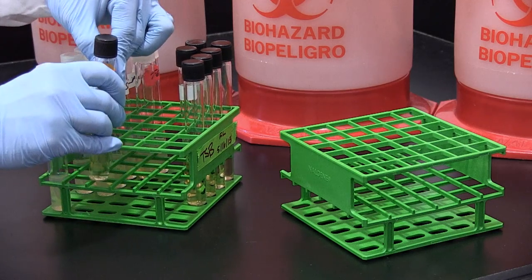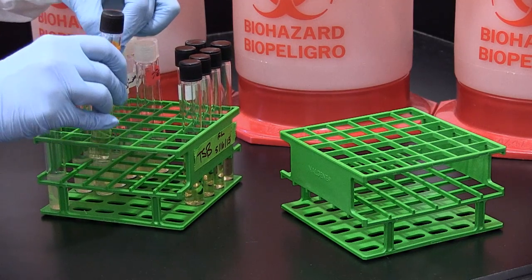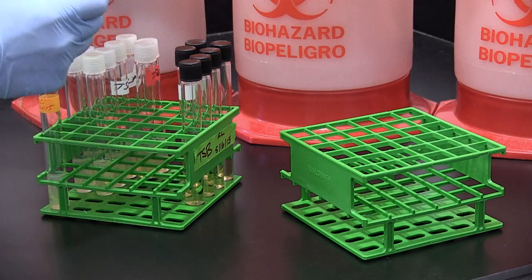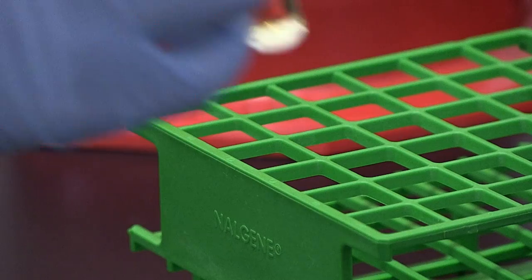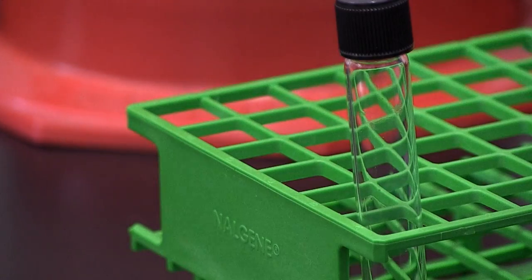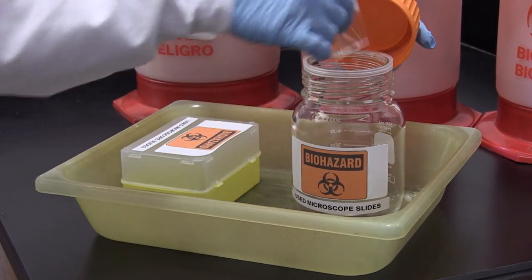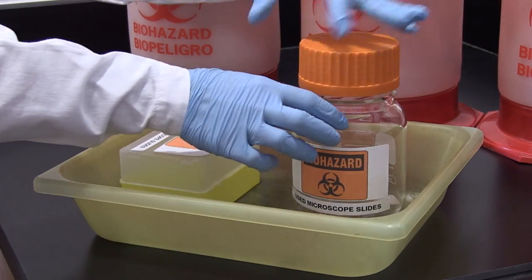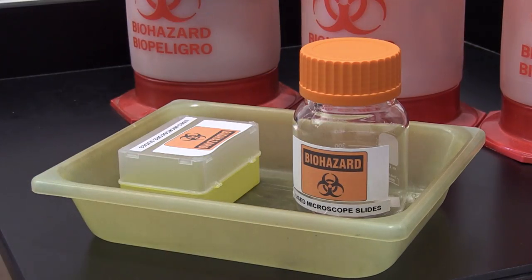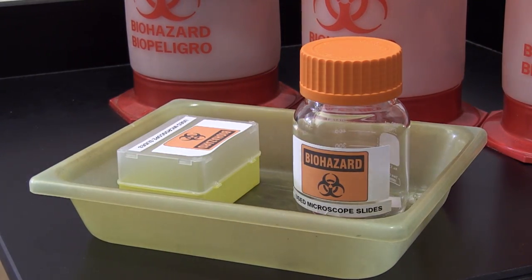Reusable supplies, such as culture test tubes and glass pipettes, should have all labels removed before being placed in a rack or container designated for autoclaving. Used microscope slides should be placed in a container for autoclaving or soaked in a disinfectant solution for a minimum of 30 minutes before being discarded.